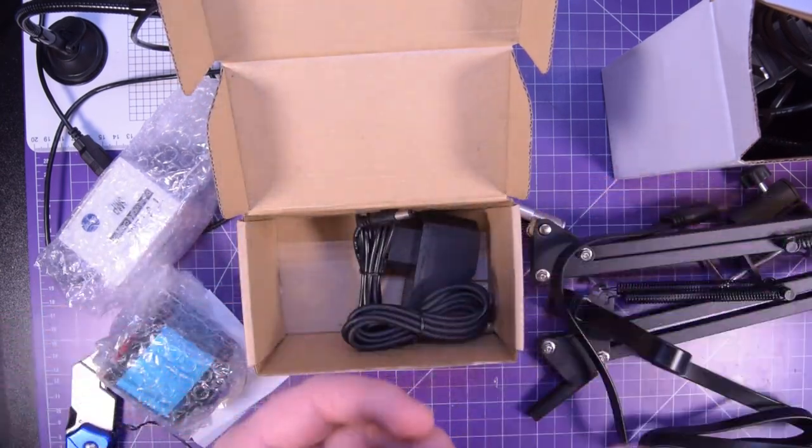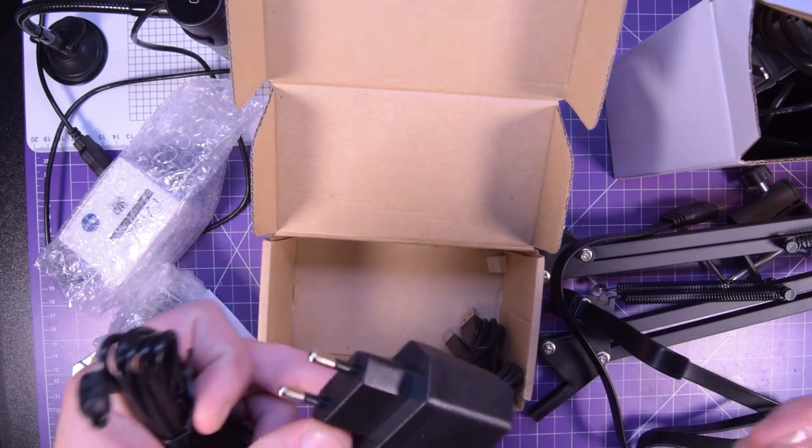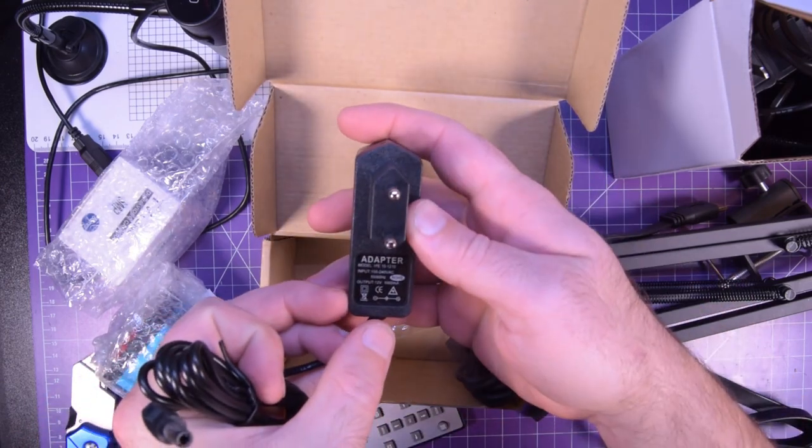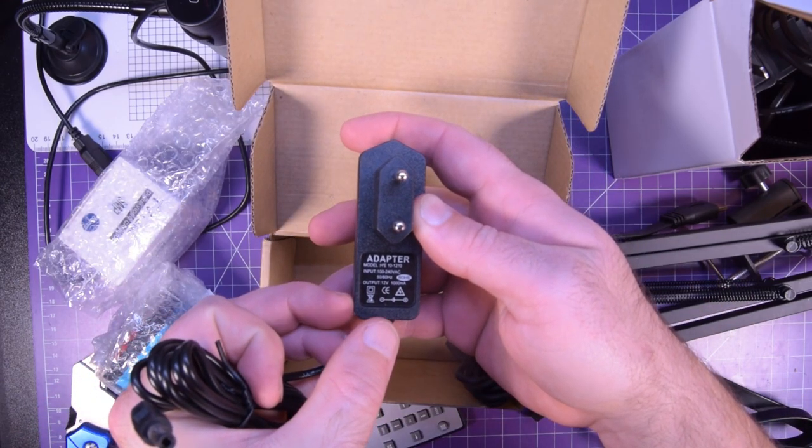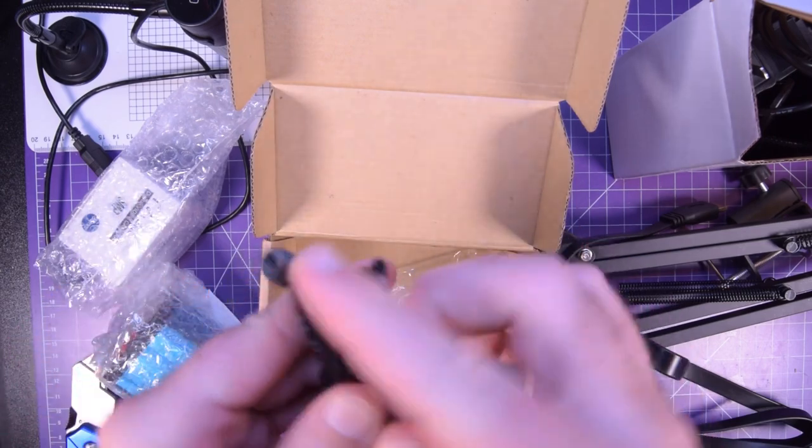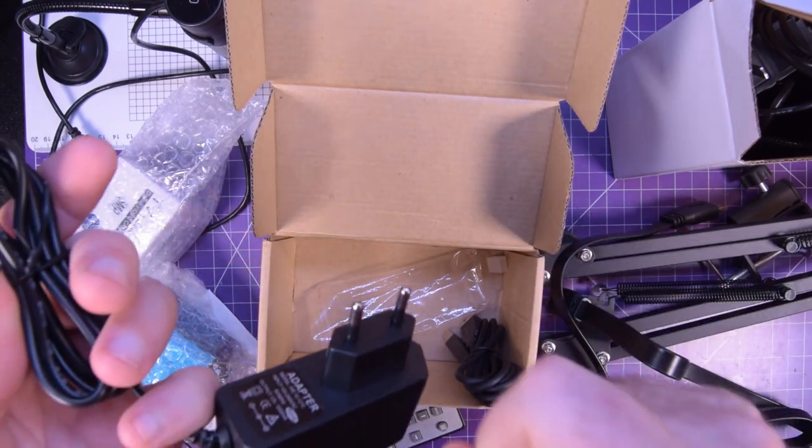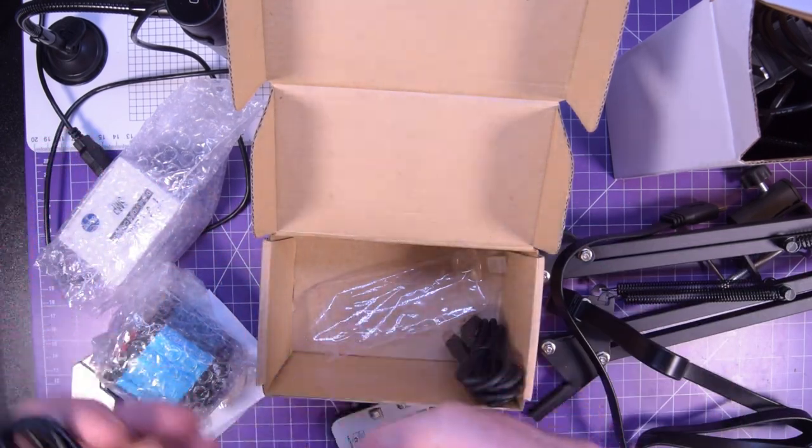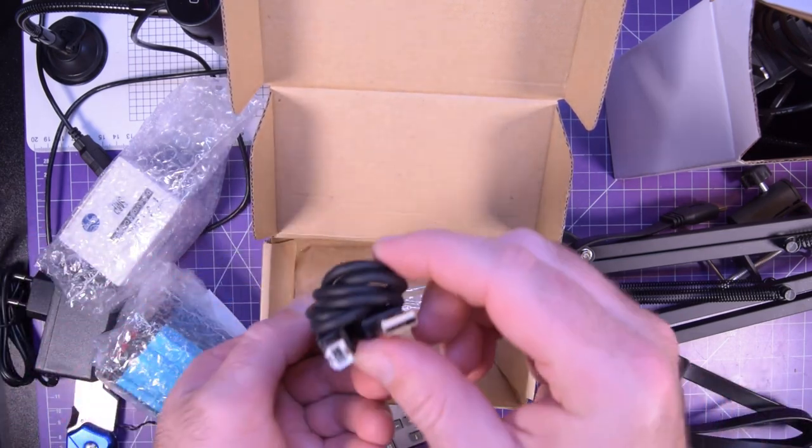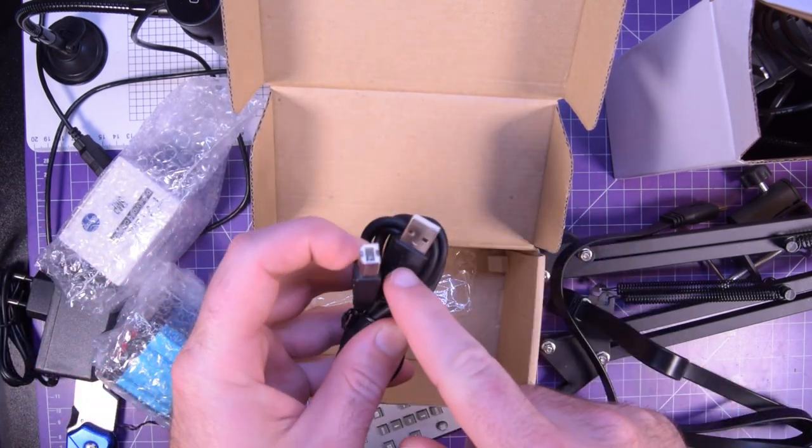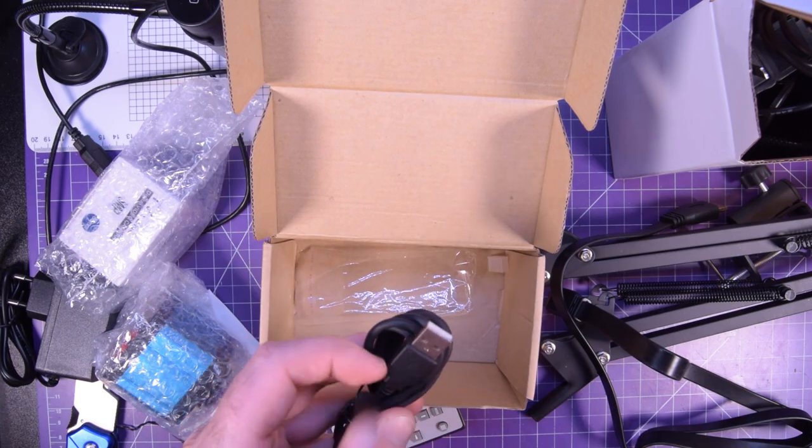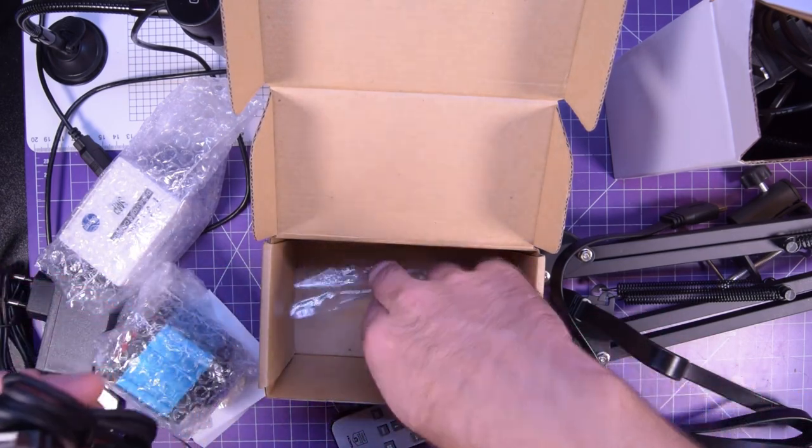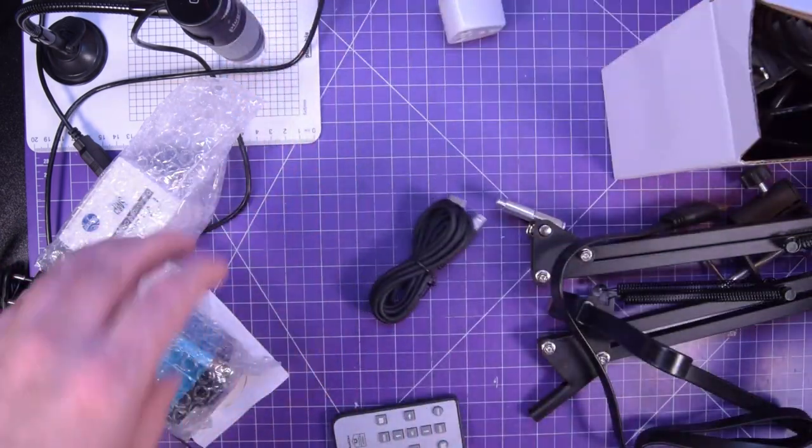Remote. Plug pack. Plug pack is 12 volts. So, I mean, we can just feed it 12 volts if we don't want to use this with the adapter. But we're going to try it as sent. USB. This is sort of like the I think this is USB type B, which is the printer plug type thing.